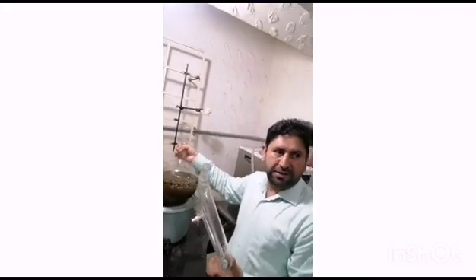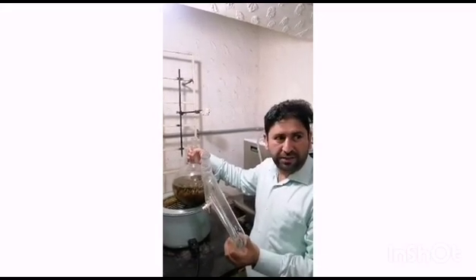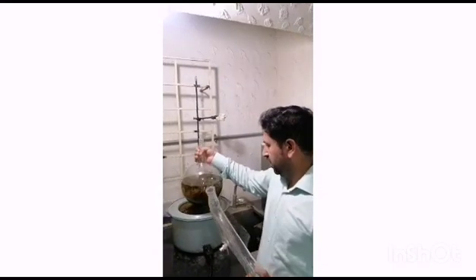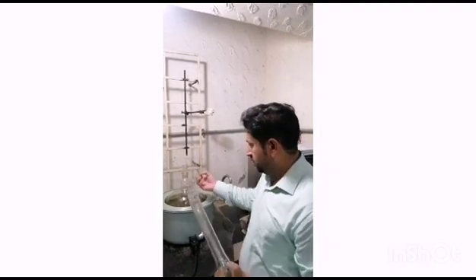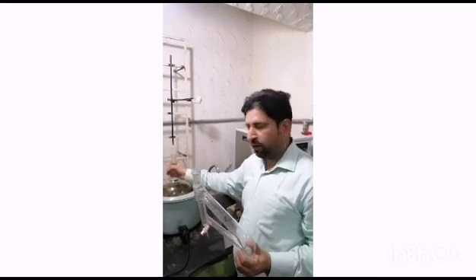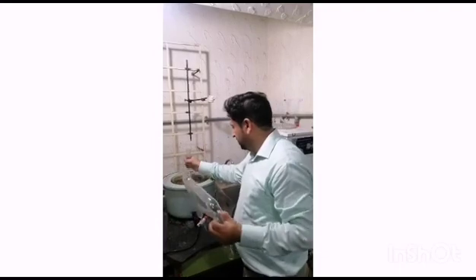Fresh leaves. We are taking 250 grams of leaves and we have put 3 liters of distilled water in it. One portion of the flask should be kept empty because there may be some bumping. To avoid bumping, you can add some glass beads or some other things that stop bumping.